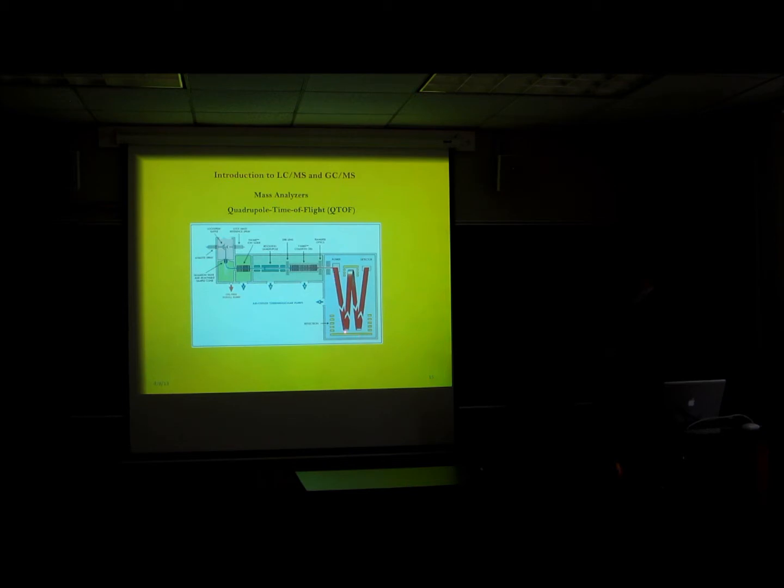The disadvantage of time of flight versus quadrupole mass analyzers for doing quantitation is that you have a smaller linear dynamic range of response for the detectors that need to be used with time of flight instrumentation.